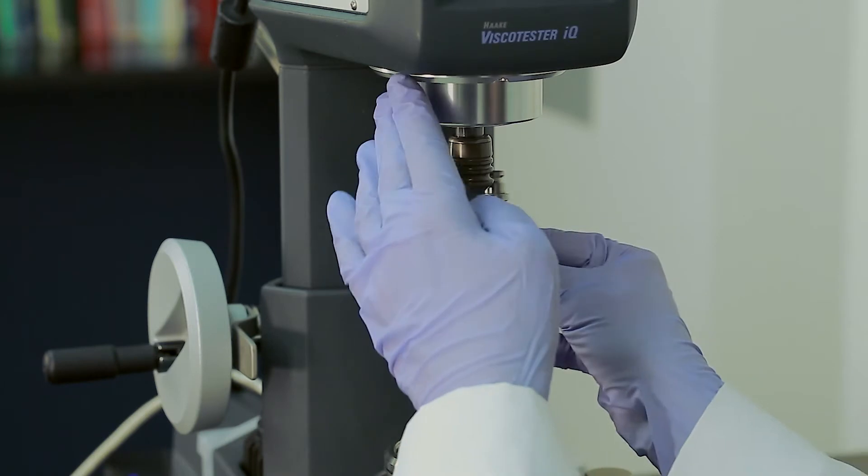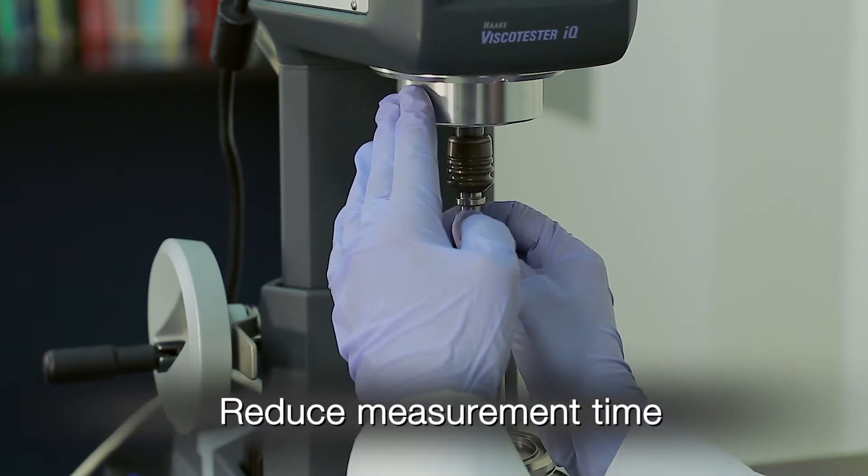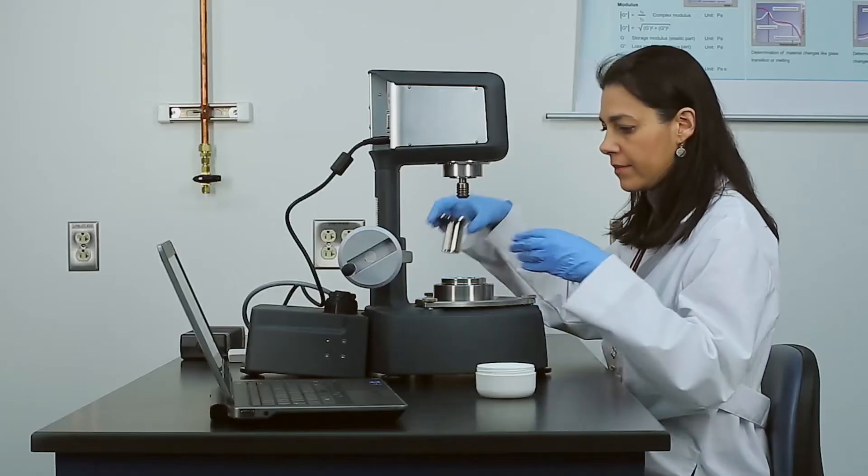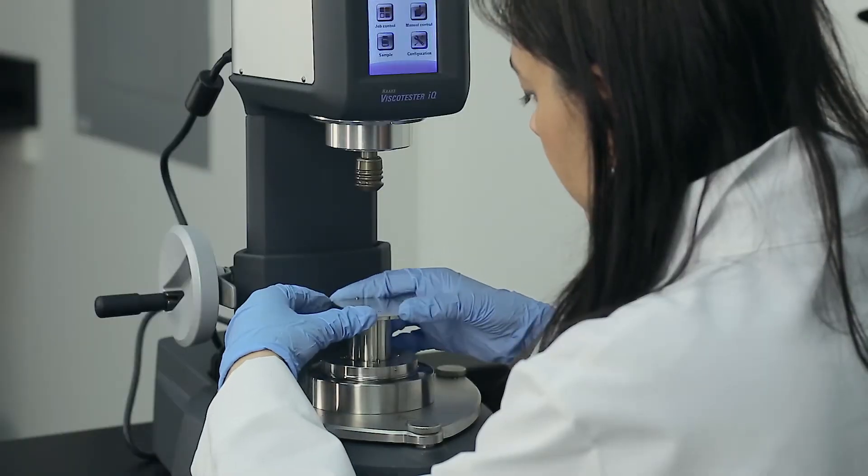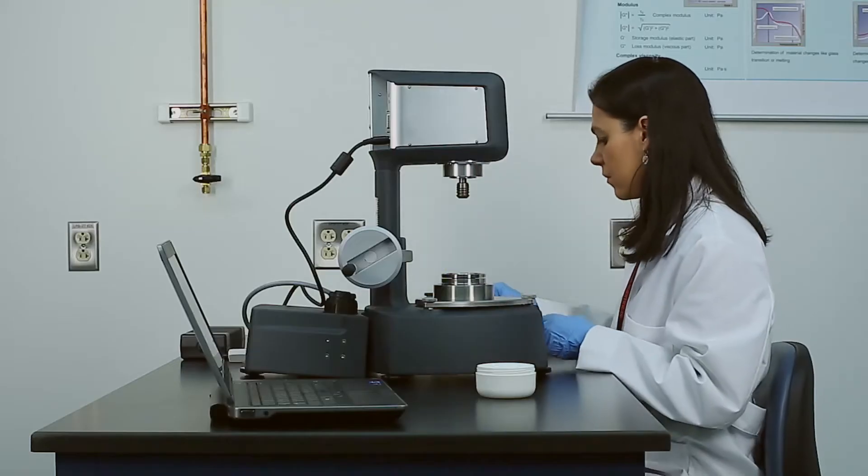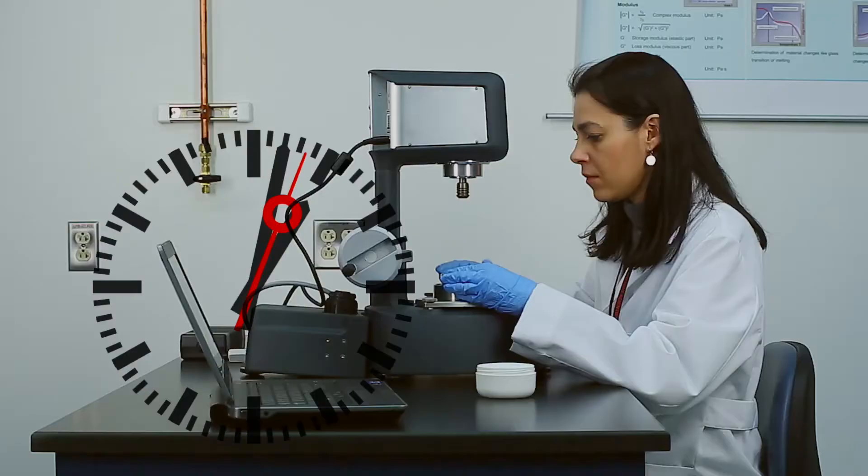Additionally, quick bayonet mounting reduces measurement times with quick pre and post handling. A measuring plate insert enables you to change between a coaxial cylinder to parallel plate configuration in mere seconds.